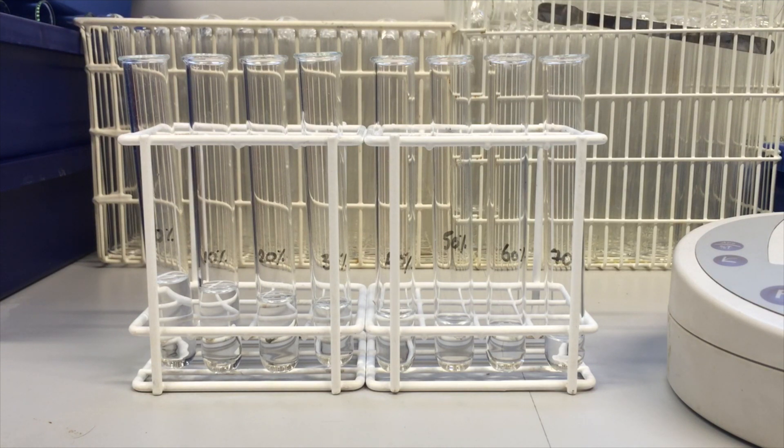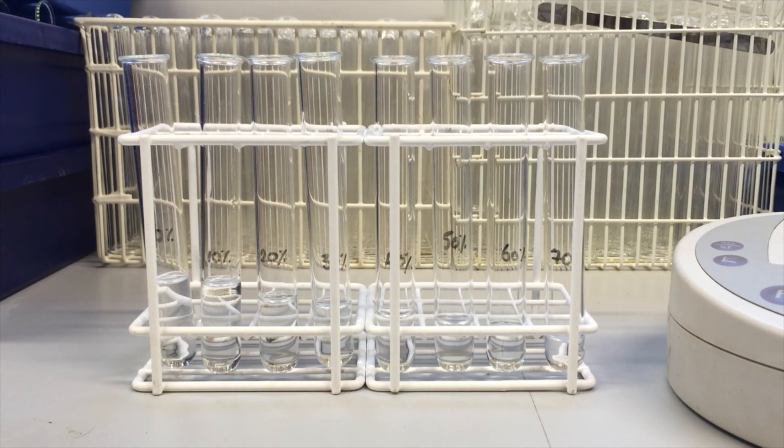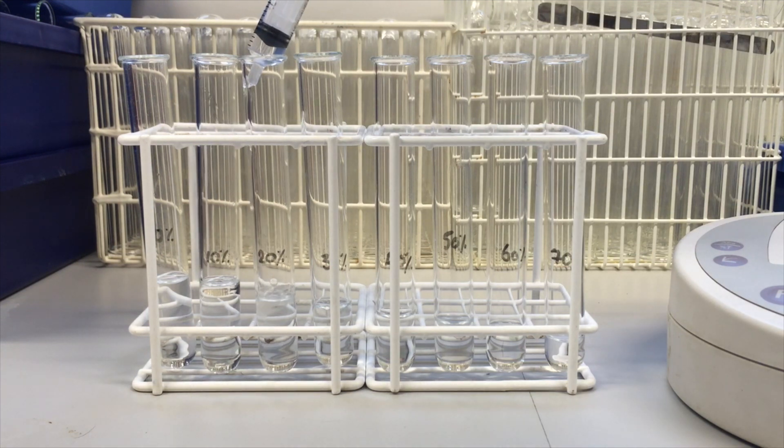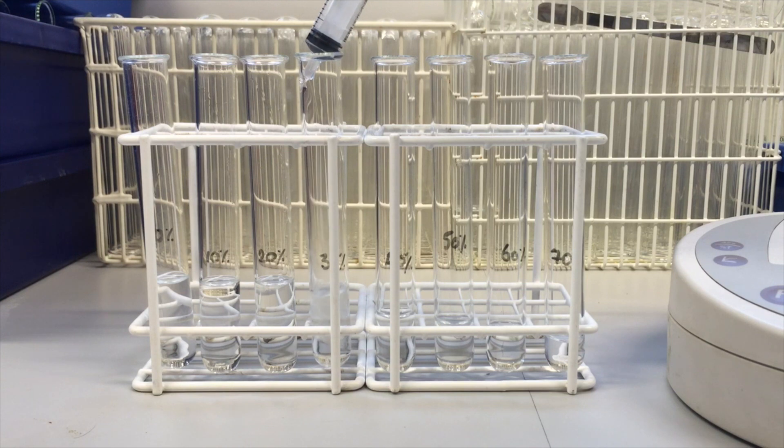So starting with the 10%. So if I want 10% of alcohol or ethanol in the tube with a final volume of five, then I'm adding 0.5 ml of alcohol into there. And for 20% I'm adding 1 cm cubed. For 30, I'm adding 1.5.